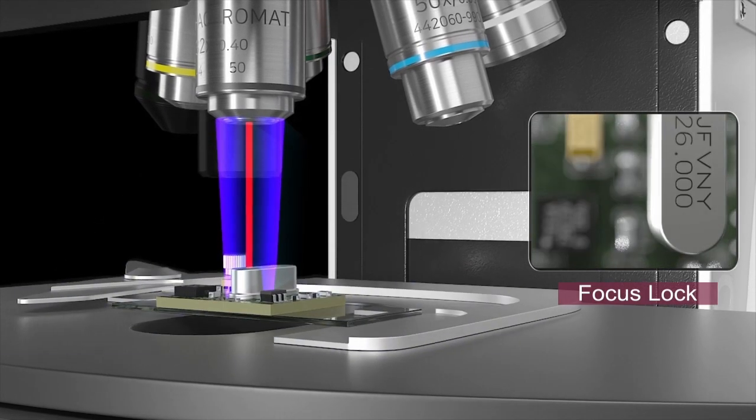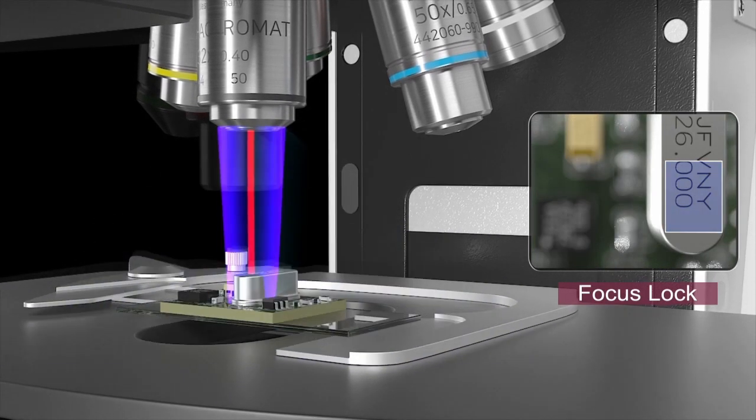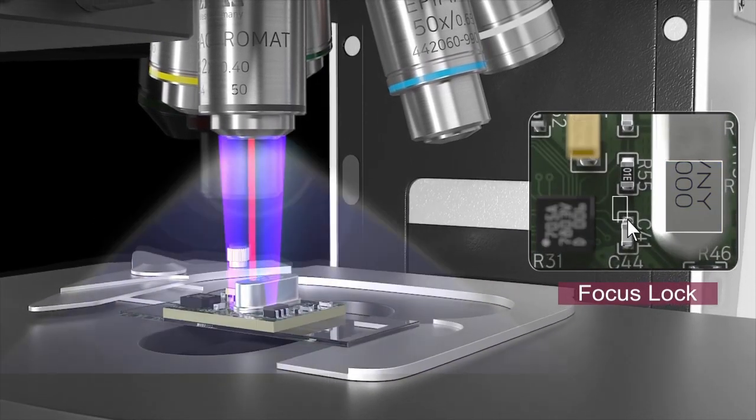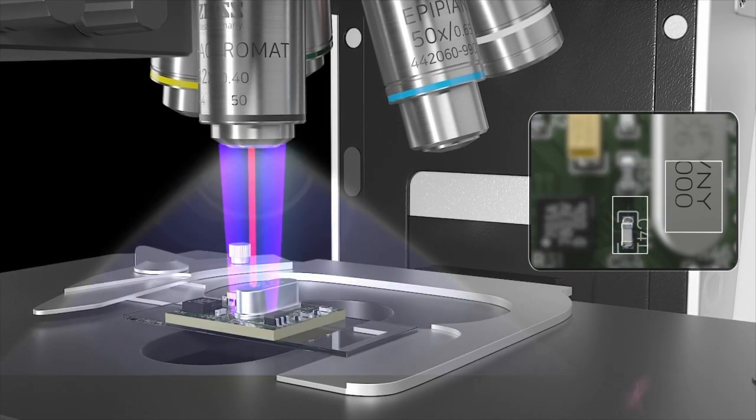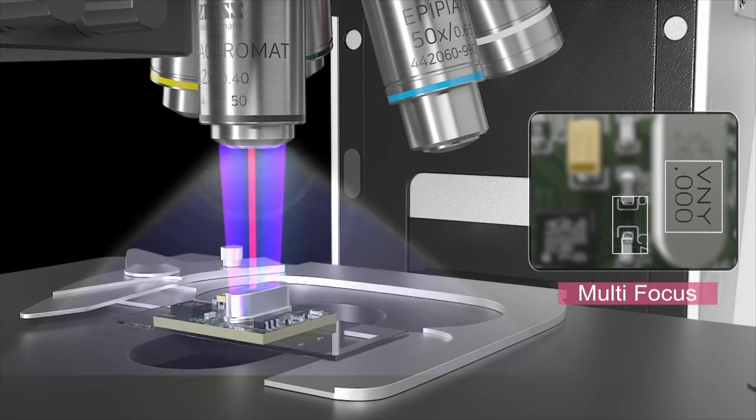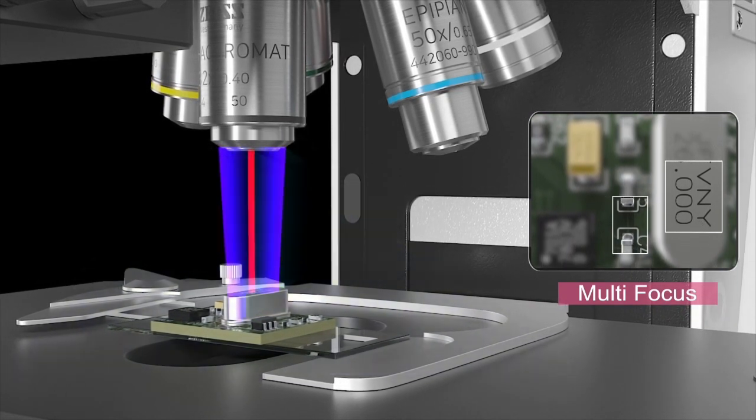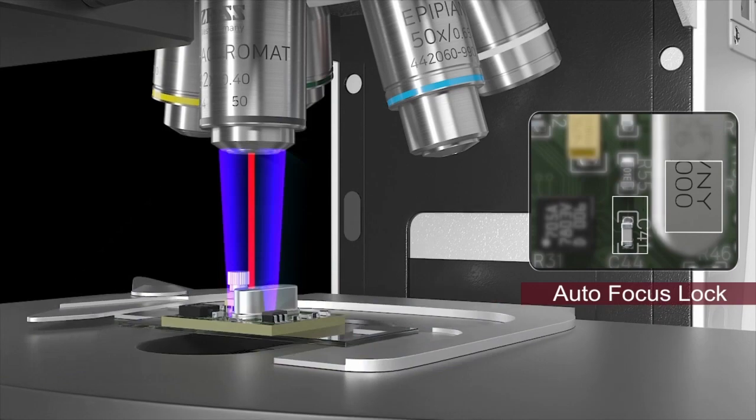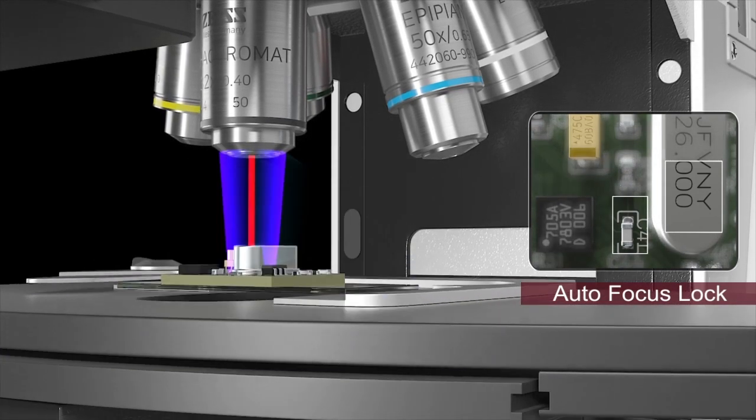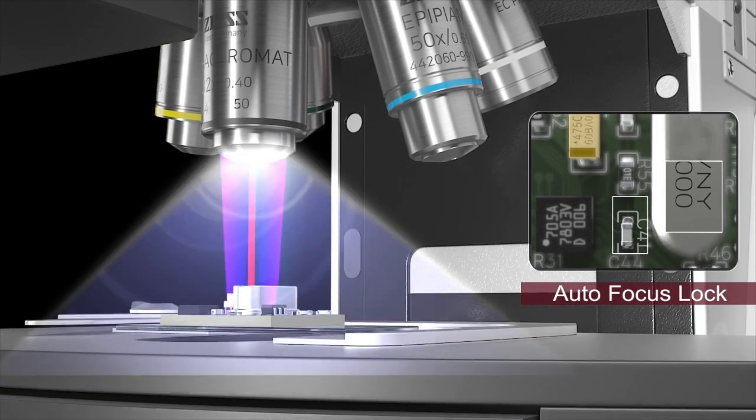Focus lock maintains focus when multiple focus ROIs are set in the z-axis. Multi-focus lock stays in focus even when moving the x and y-axis. Auto-focus lock retains autofocus during z-axis movement and others. These functions maximize user convenience.